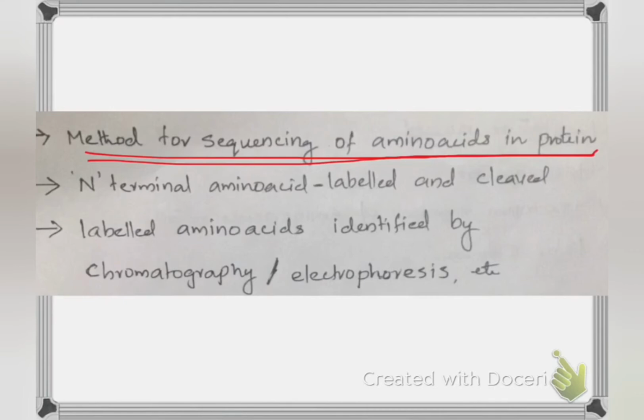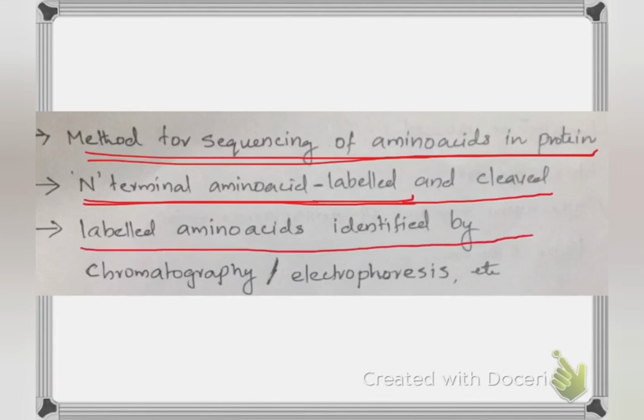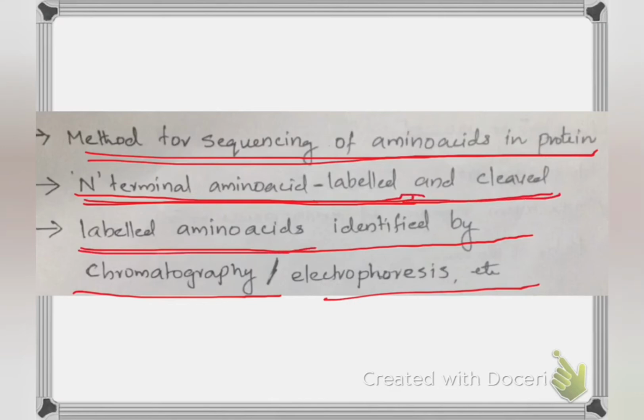In this reaction, first the N-terminal amino acid is labeled, and that labeled amino acid is then cleaved. The labeled amino acid is then identified by methods such as chromatography and electrophoresis.